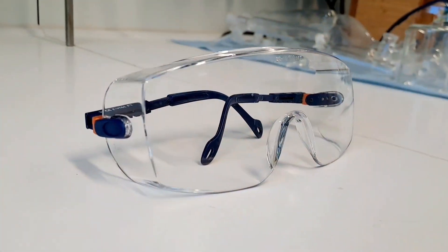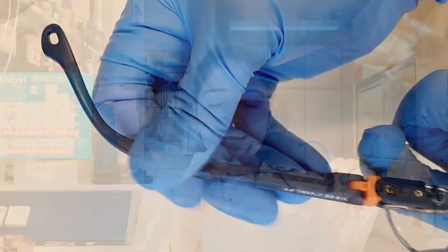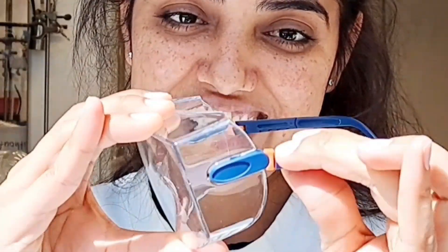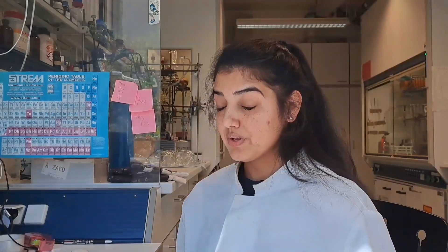Now moving toward the next pair of glasses. These are really important if you are working with extremely dangerous or highly volatile chemicals, because they give not only side protection but also a huge protection from the top as well as from the bottom. Again, they have adjustable wings you can adjust according to your head size, plus adjustable ear pieces so you can adjust them according to your face type. They give full gripping from the top, so if any chemical falls down from above it will never enter your face or eyes. They are breathable and have very good ventilation, so they are less likely to fog up.